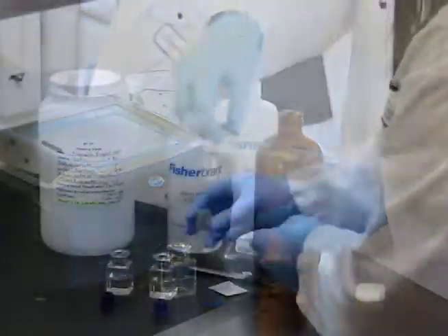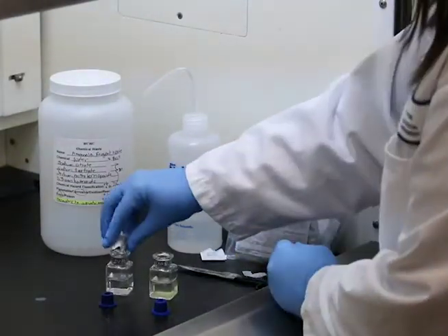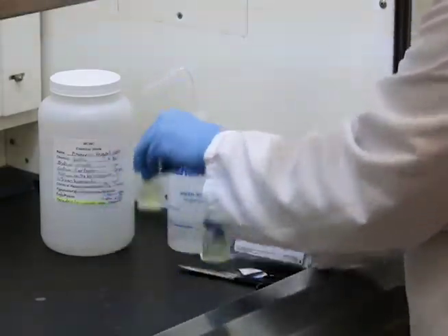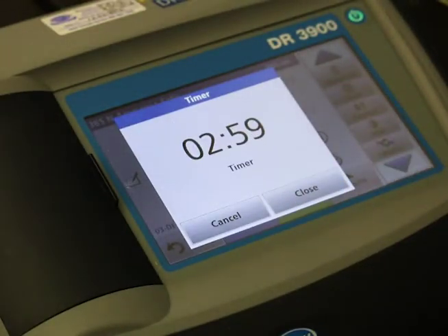Add the contents of one ammonia salicylate powder pillow to each cell. Stopper the cells and shake to dissolve the reagent. Start a timer for three minutes of reaction time.